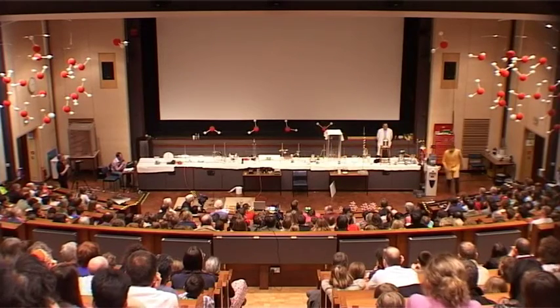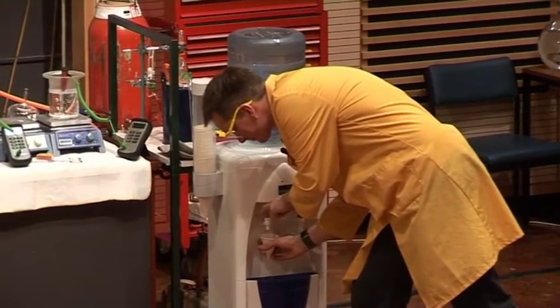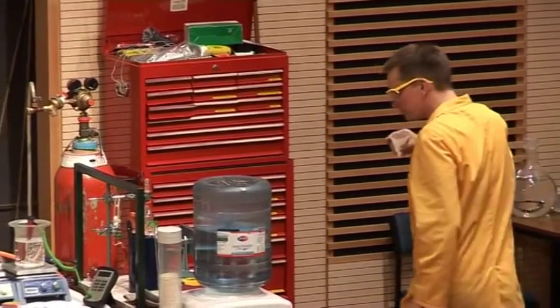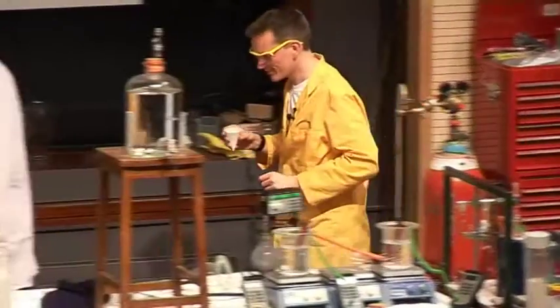So I need some water. I'll just come around here to the water dispenser. It really is just normal tap water — well, I'm sure it isn't tap water, it's very nice mineral water, of course.